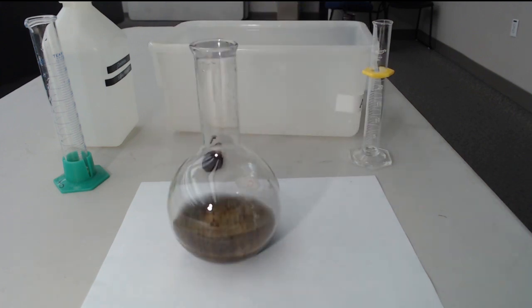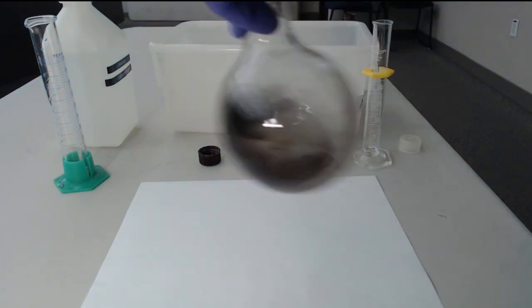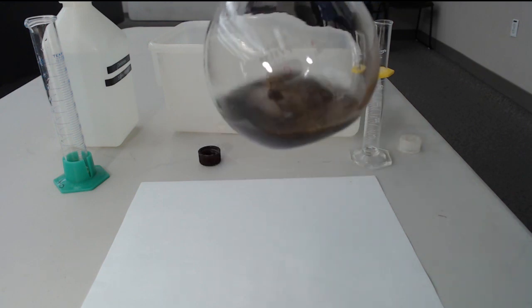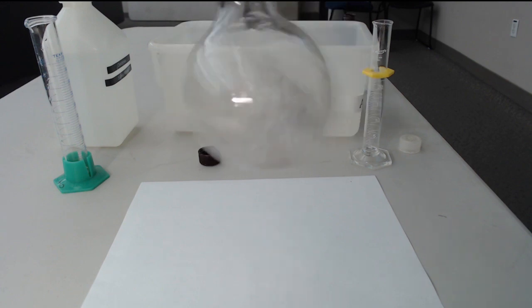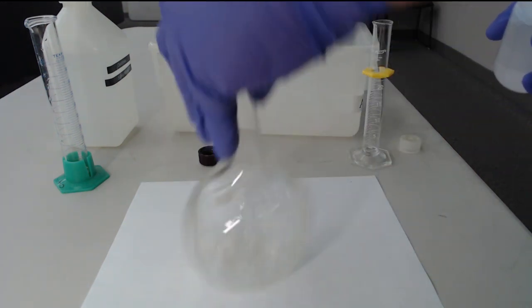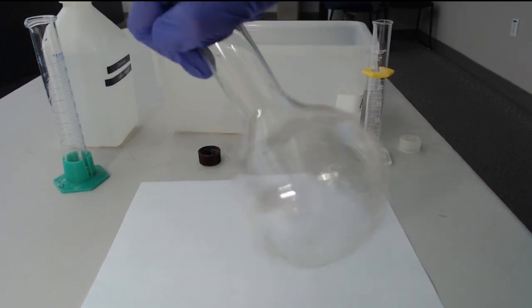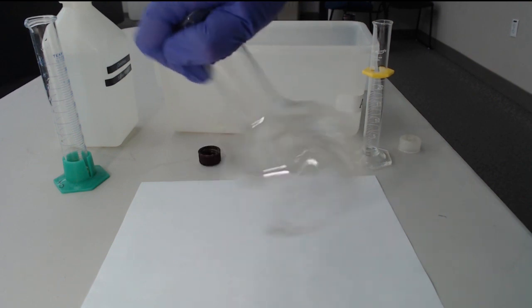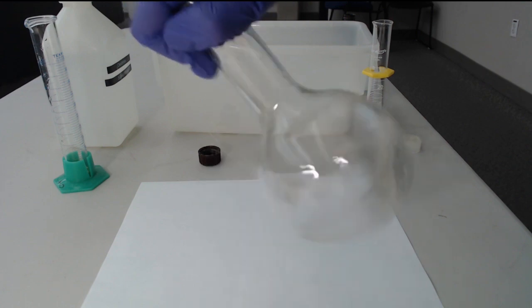And now I'm going to go ahead and add a little bit more ammonia to it and see if anything else happens. I'm going to go ahead and add it dropwise. What happened? Oh my goodness. Like a magic trick. So evidence of a reaction. The formation of the solid is evidence of a reaction and dissolving the solid like that too is also evidence of a reaction.